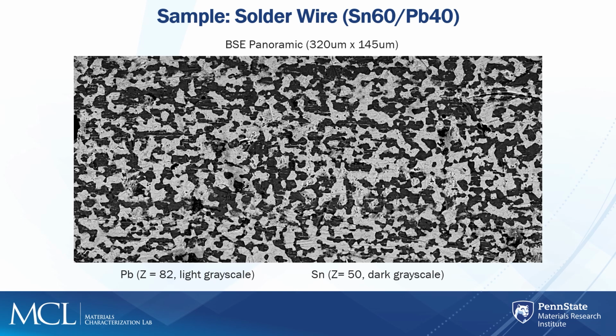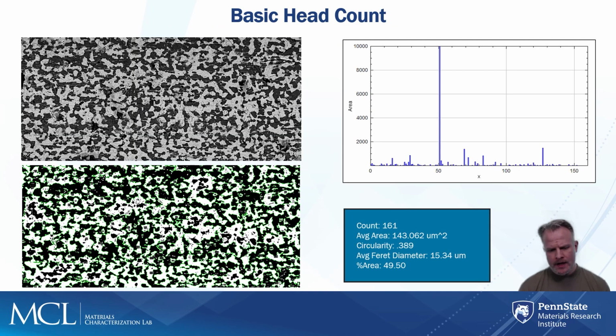With an image like this, quantifying structures and trying to get underneath and pull data out of this can be pretty challenging. Post-processing is typically used, or at least most often reached for, particle counting and pore counting, but with more complex network structures like this, you face a couple of challenges. Firstly, let's take a look at a basic head count. Is this one complete network of lead? How many individual networks are there?